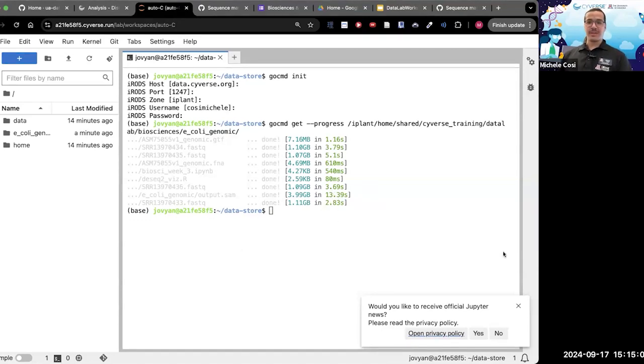Excuse me, I lost my train of thought a little bit. But what have we done so far? We have gotten some data from CyVerse, and I'm going to do the last step, which is cd, change directory, into the E. coli genomic folder. I'm going to paste this in the chat.